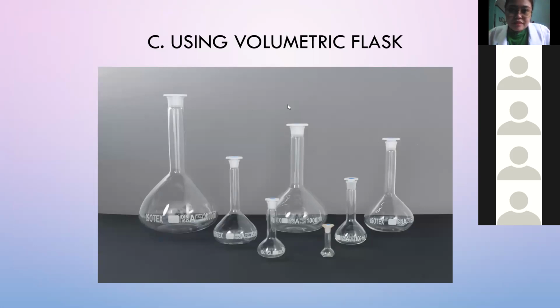Okay? So ginagamit ang atuang volumetric flask to contain. Okay? Dili siya parehas sa burette and sa pipette na pwede sila to deliver. Kani this one is to contain if we want to make solutions. So pareha sa application nato sa ato ang gina-compute sa lecture, mga different concentration. So kung gusto ka mubuhat og 1 molar na 1,000 ml na solution, then you will be going to use the volumetric flask para maka-measure jud kag exact 1,000 ml.